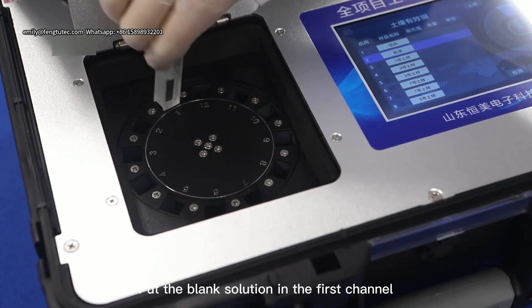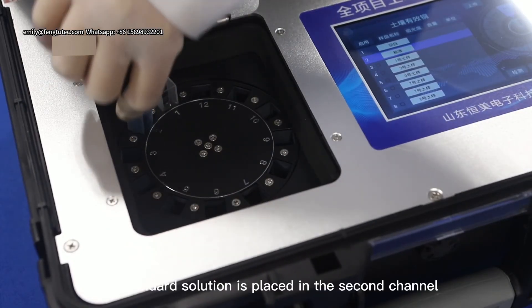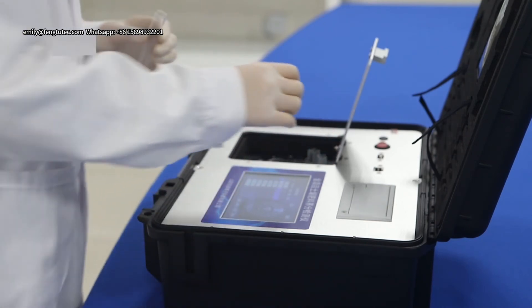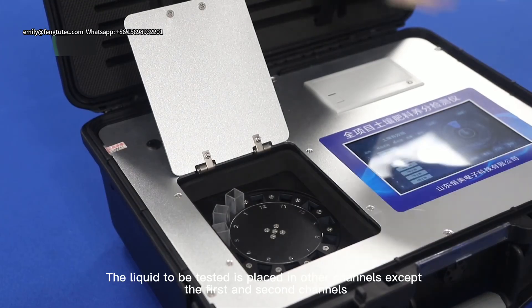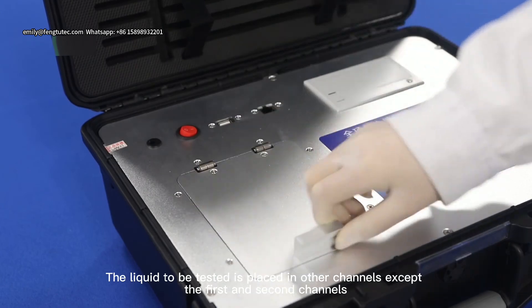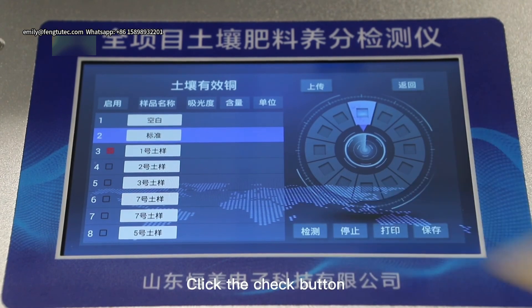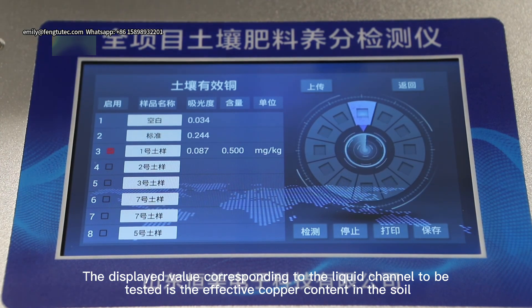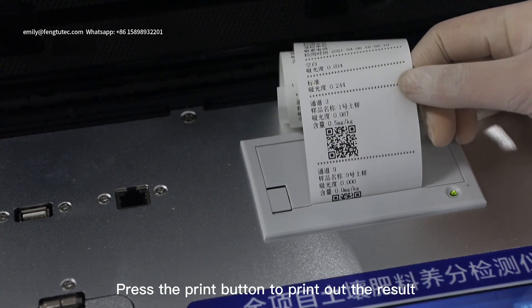Put the blank solution in the first channel. Place the standard solution in the second channel. Place the liquid to be tested in the remaining channels. Click the check button. The displayed value corresponding to the test liquid channel is the effective copper content in the soil. Press the print button to print out the result.